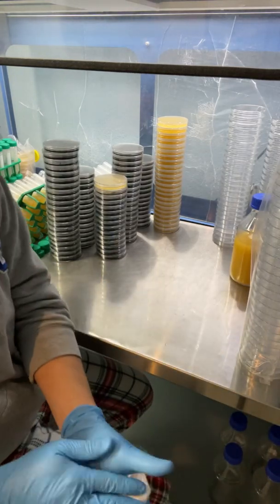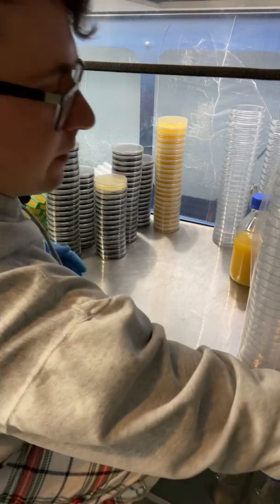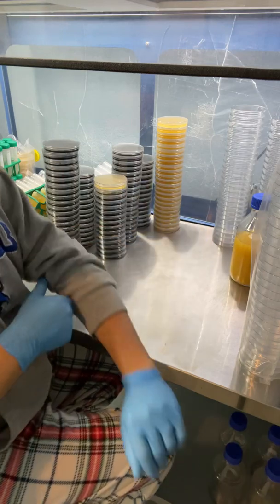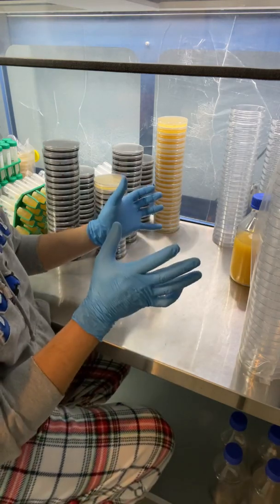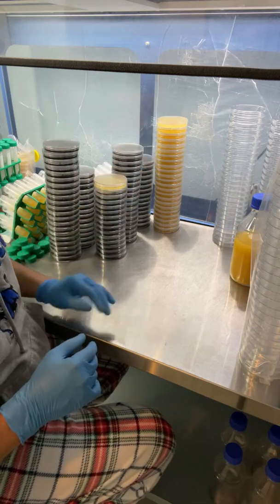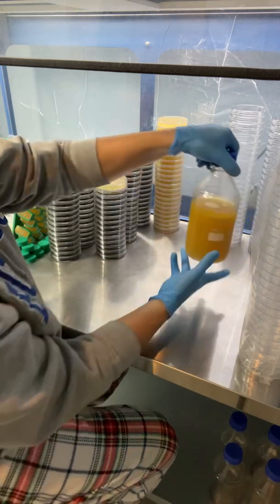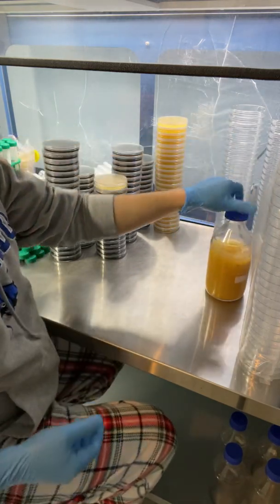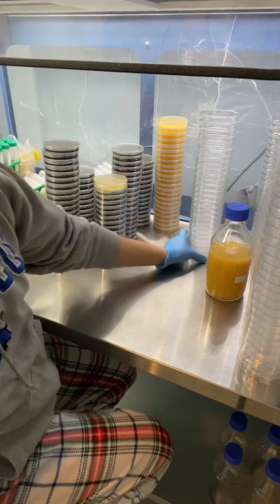If anyone's wondering what the crack is in the back, that's from resting fruiting blocks against the plastic — it heated up and cooled and then it caused that crack. But I caulked it up and it's not allowing any airflow. I want to upgrade to a stainless steel housing though — those are the best.